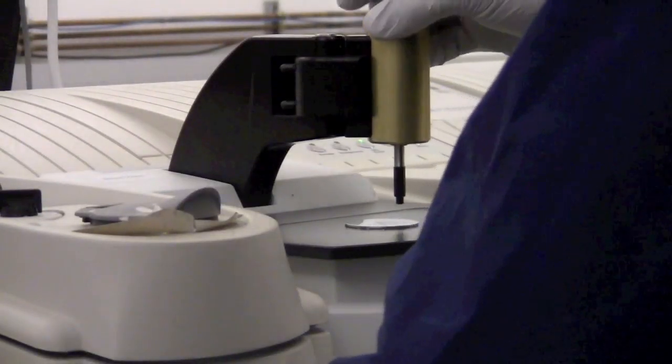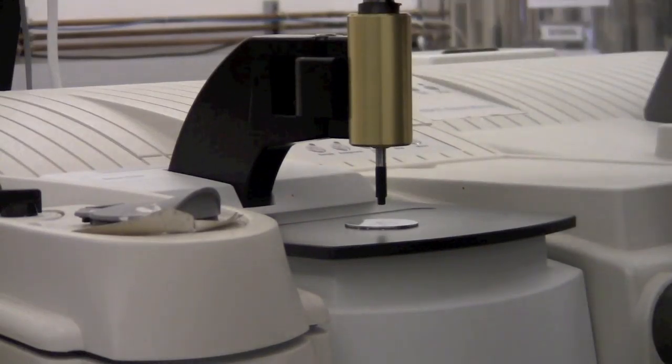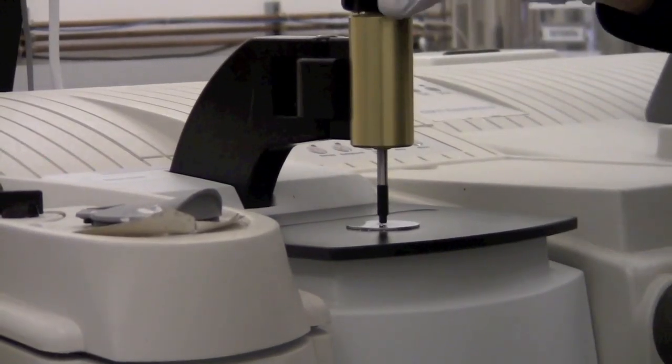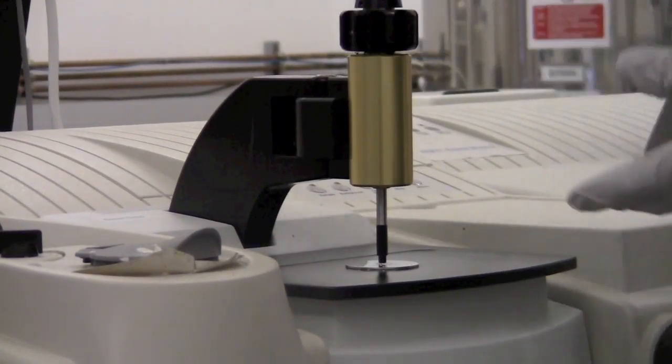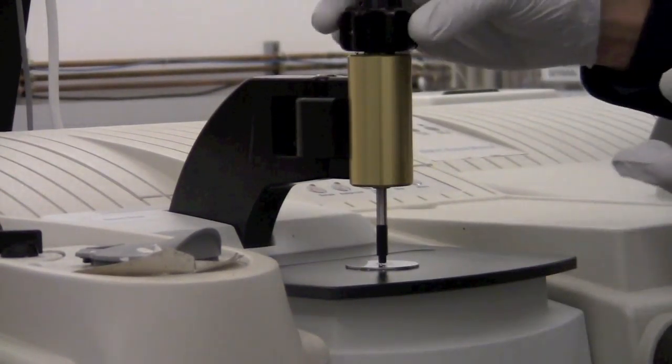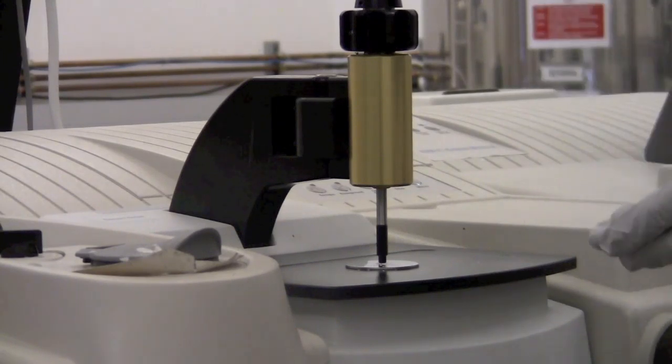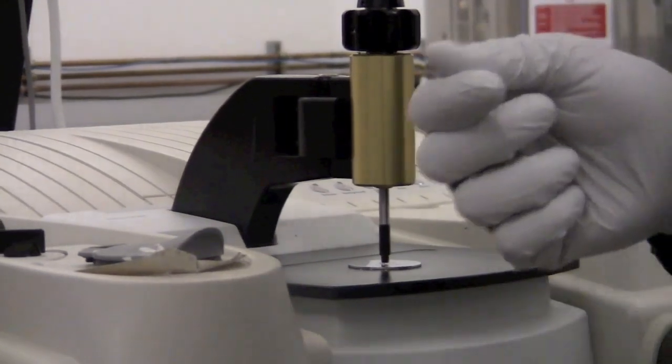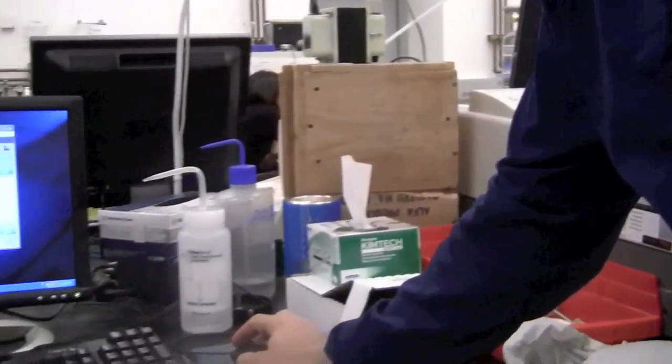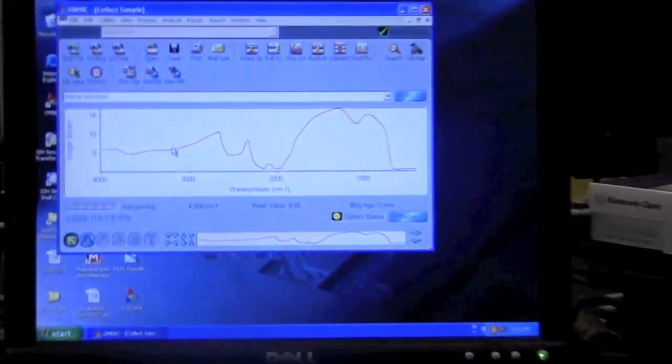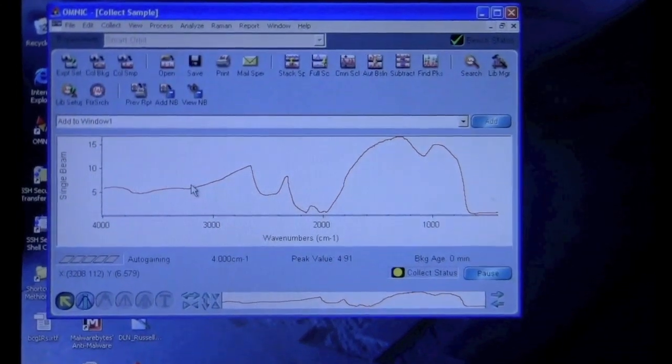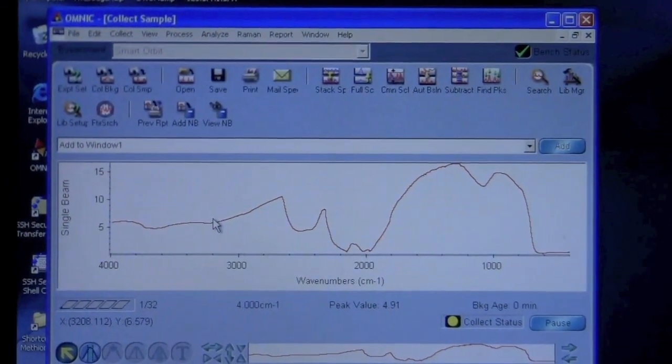Then to make good contact with the surface of the diamond, we use the press here. You turn it until it clicks, and that means it's pressed down hard enough. That ensures you have a repeatable amount of force pressing down on the sample and on the diamond. Then we can go back here and click OK to collect the sample spectrum. It should take the number of scans that you've selected.